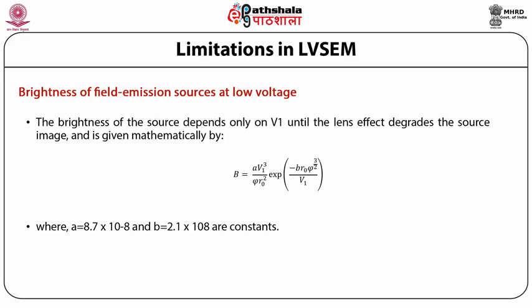Several field emission guns have been designed to incorporate a magnetic lens that operates on the beam leaving the tip. These magnetic lenses possess advanced electron optical characteristics compared to the electrostatic lenses and produce improved performance when operating at high current and low beam voltage.